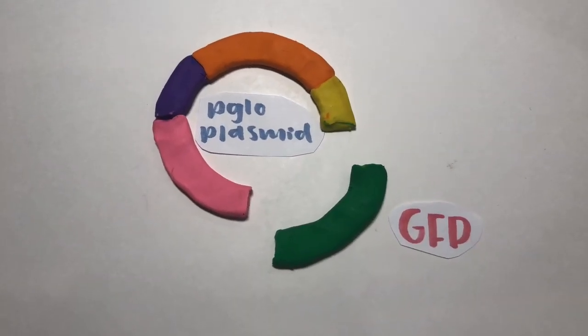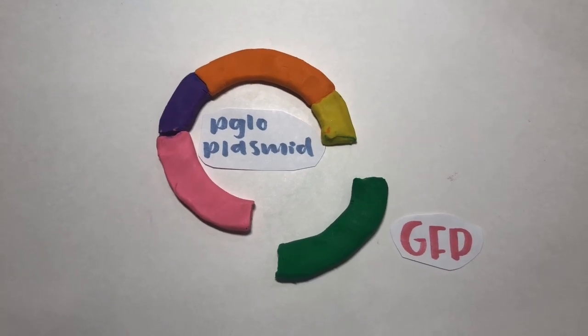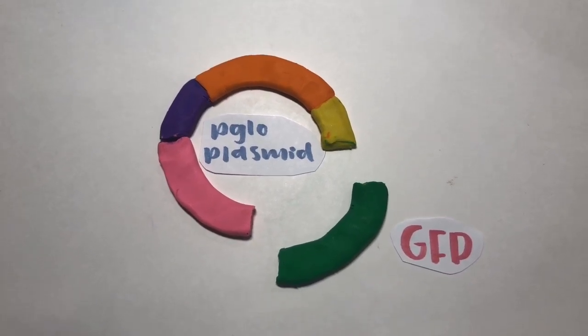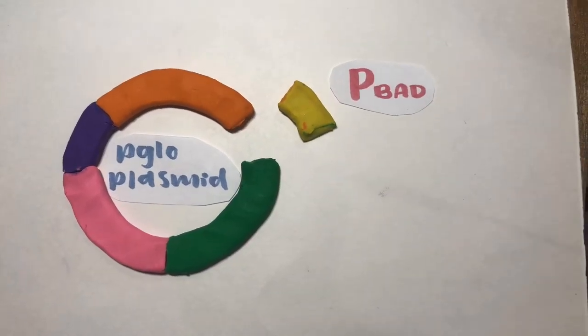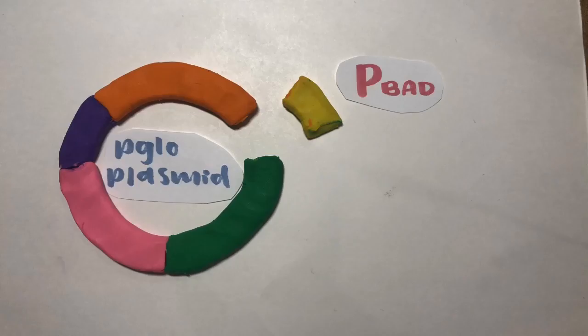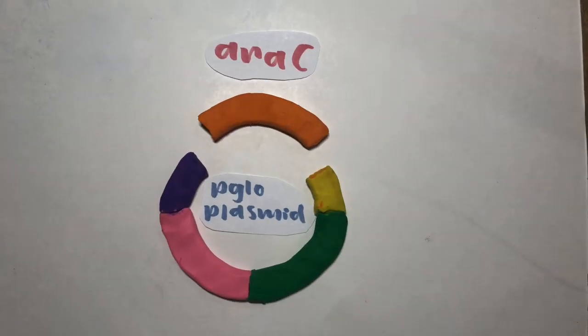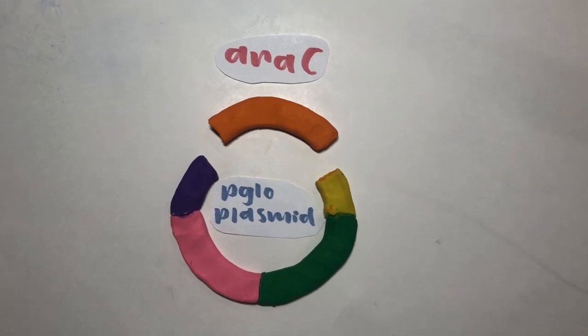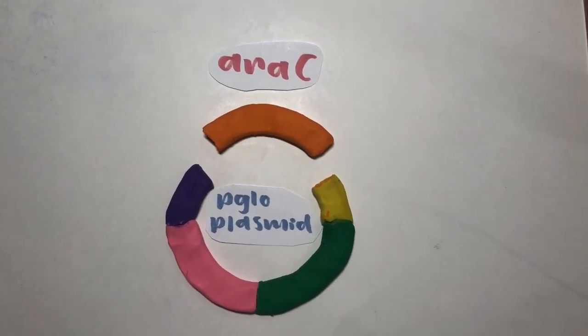GFP stands for green fluorescent protein. That's going to be the green glow that we're seeing out of our bacteria, and it originally comes from a jellyfish species, A. victoria. The PBAD is the promoter for the arabinose operon, and the job of an operon is to make sure that this whole plasmid is only going to be transcribed when arabinose is present. The ARA-C codes for a regulatory protein for the operon.